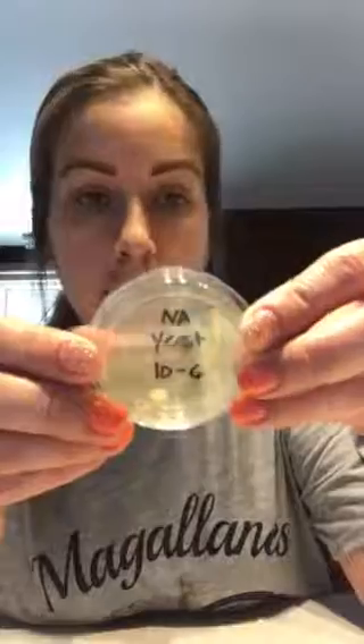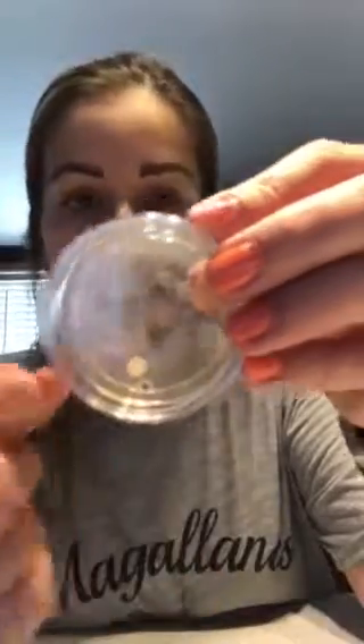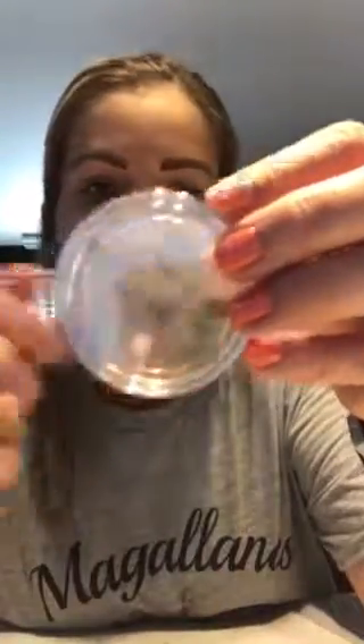The last one, 10^-6, only developed two larger colonies and a little bit of smaller ones. This has a count of less than 30, so it's not viable — it was too few to count. Thank you so much, have a great day.